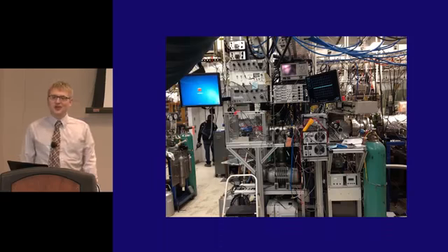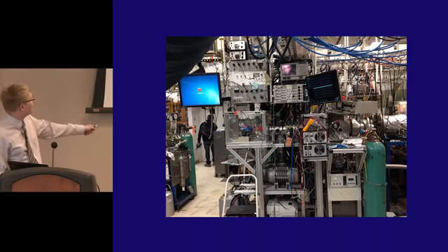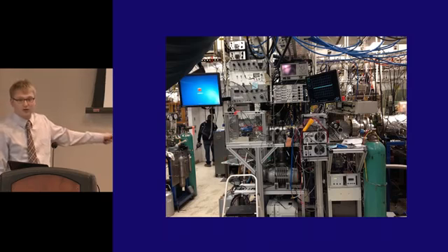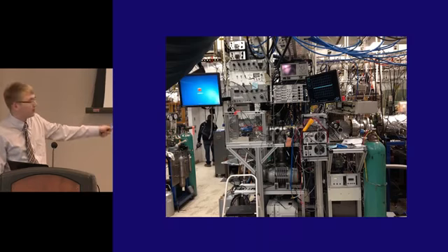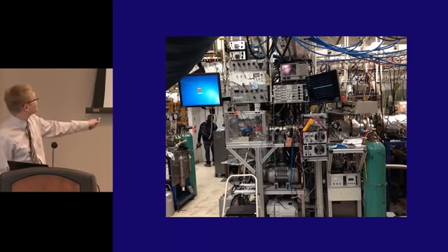Here's what the source looks like now, a little bit different. As you can see here, right here is the needle that we were talking about earlier, where the spray actually happens. Inside this chamber here is the quadrupole deflector. These are 3 home-built power supplies that run the ion guides. And here is the controller that tells the ion trap when to release the ions.